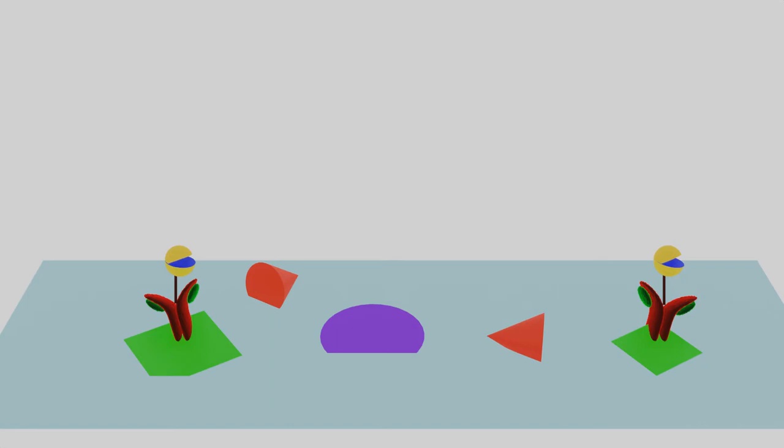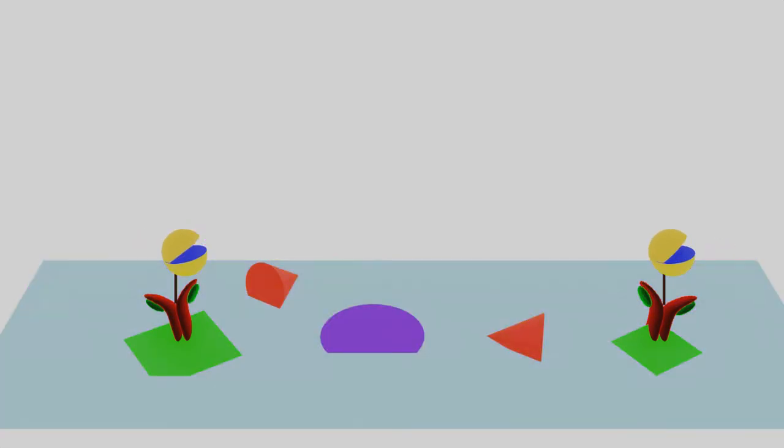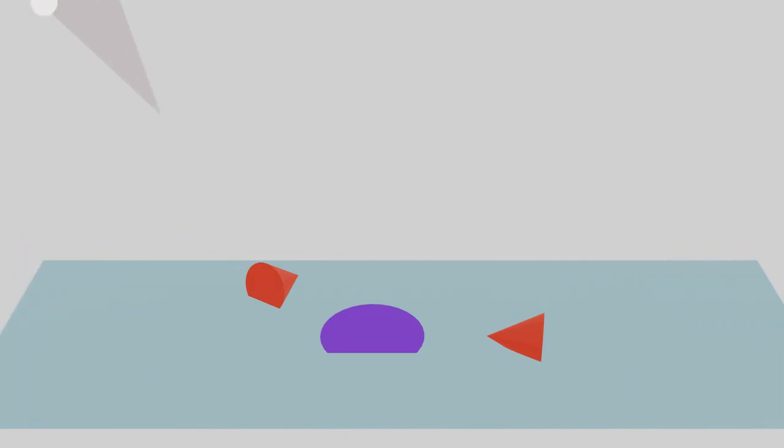So, if you now add the colorless substrate, it's going to produce a product, which you can detect as a visible color change. But if HIV was not present, then neither was the antibody, so you won't see a color change. But wait, there is a problem here.